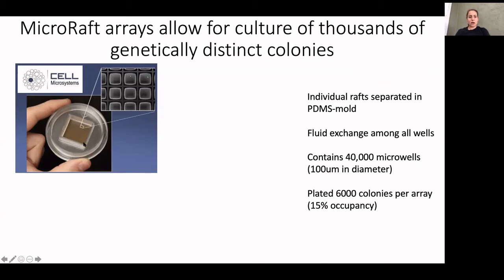However, they share a common media reservoir, so they're really easy to work with. There's fluid exchange among all of the wells. So if you want to change media on these arrays, you simply suck up the media that's there, and in one pipetting swoop, you add new media, and it will immediately cover all the arrays, or all of the wells.